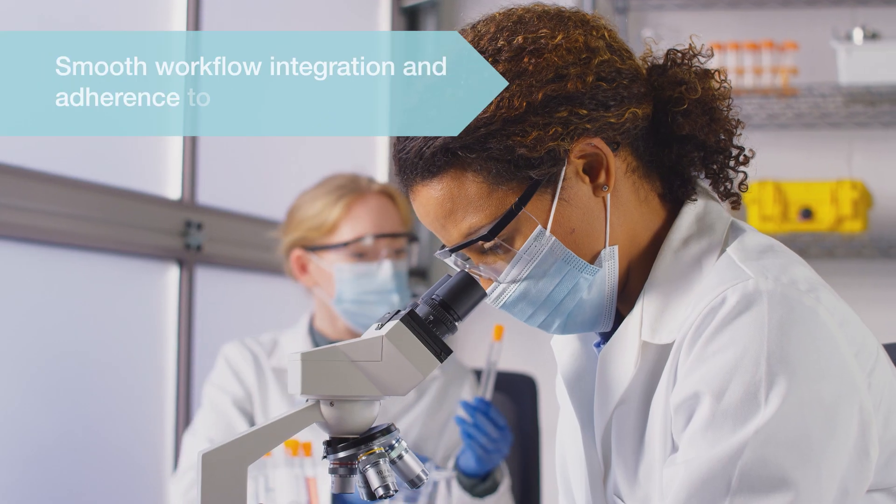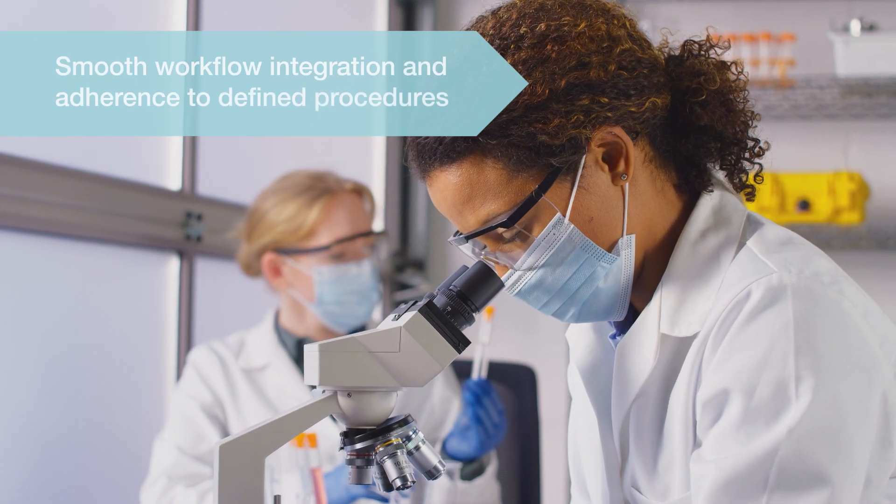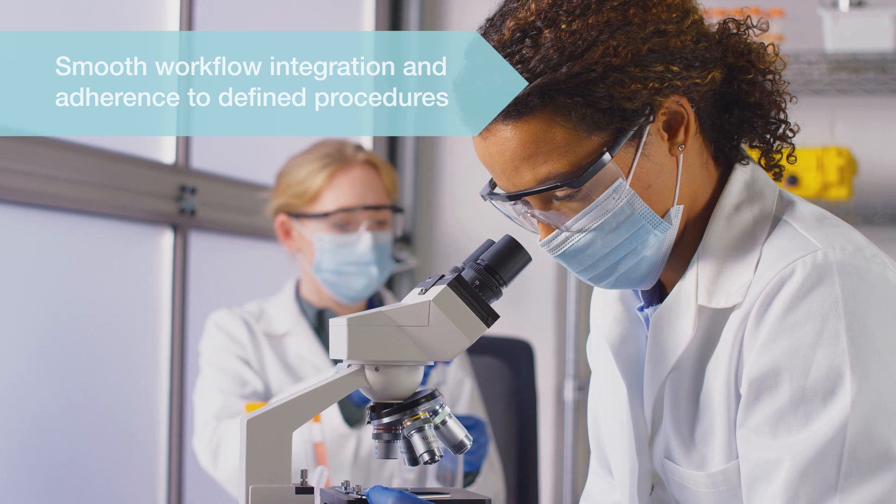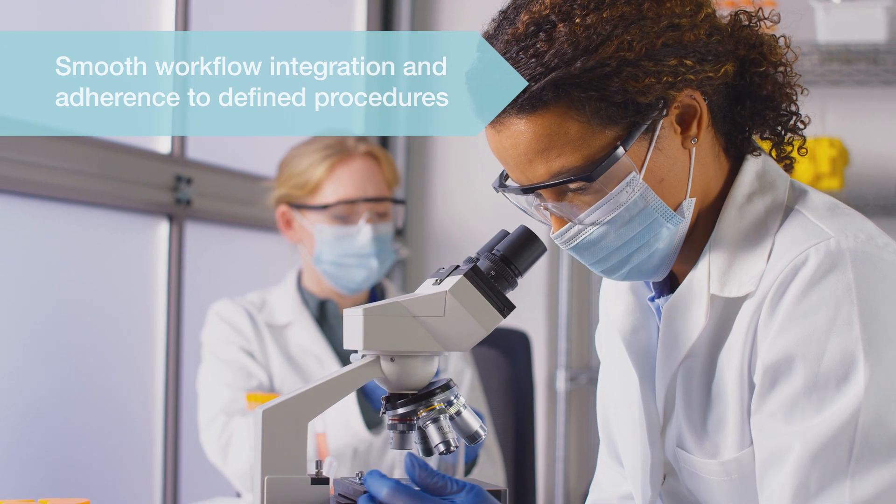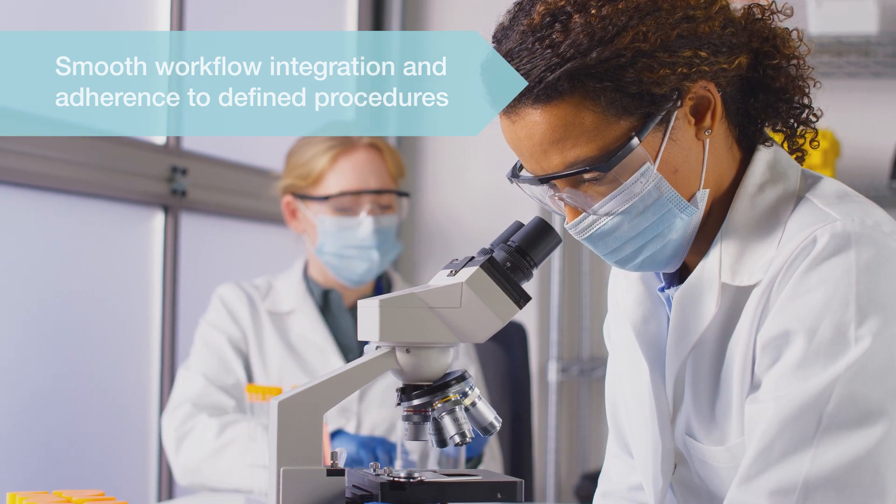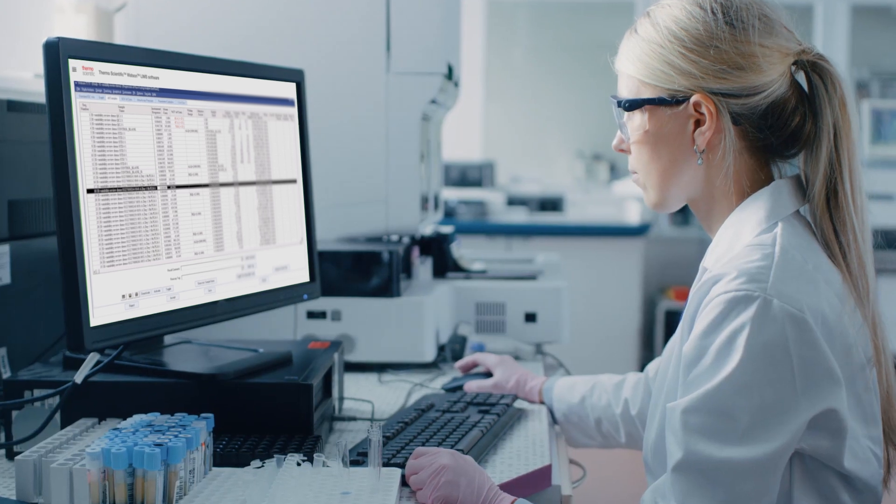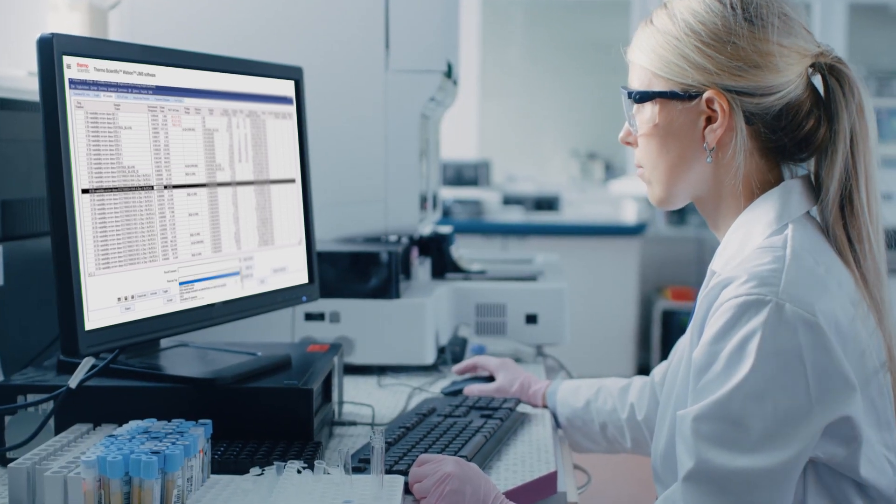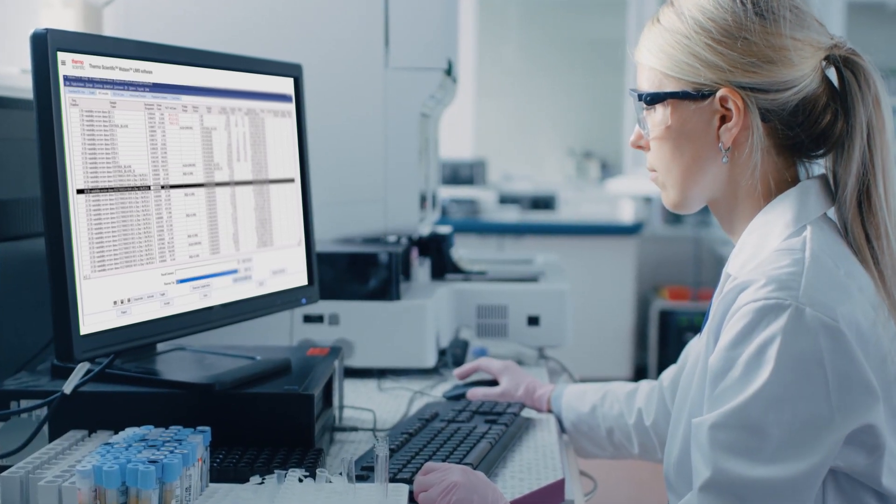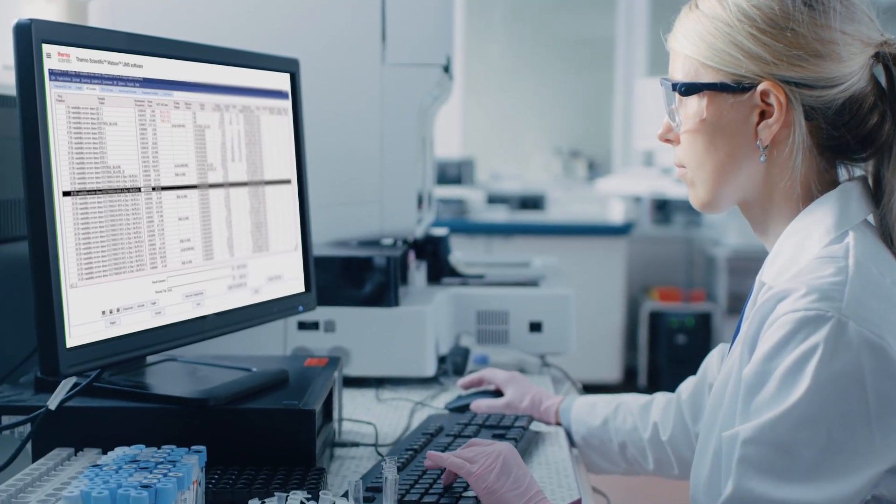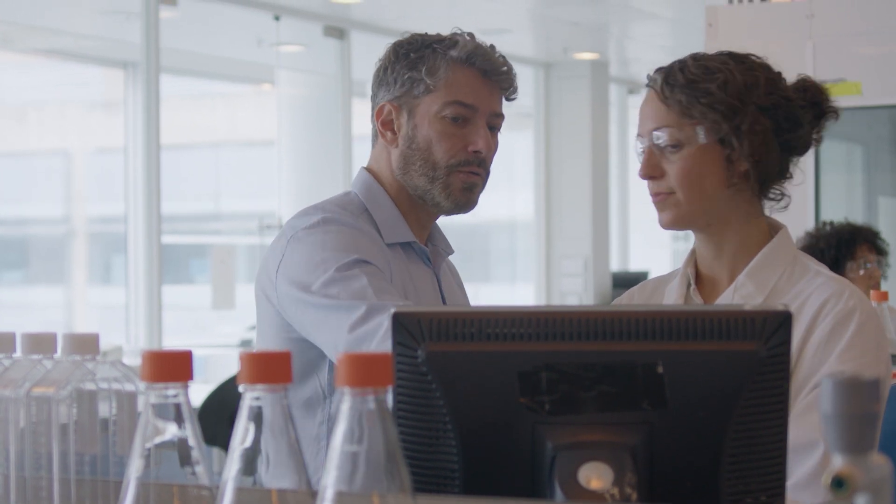It streamlines method validation, sample handling and management, offering an integrated workflow that adheres to defined procedures. Watson-LIMS software automates assay decisions and summarizes study results, simplifying your review and aligning with study protocols for accurate data management.